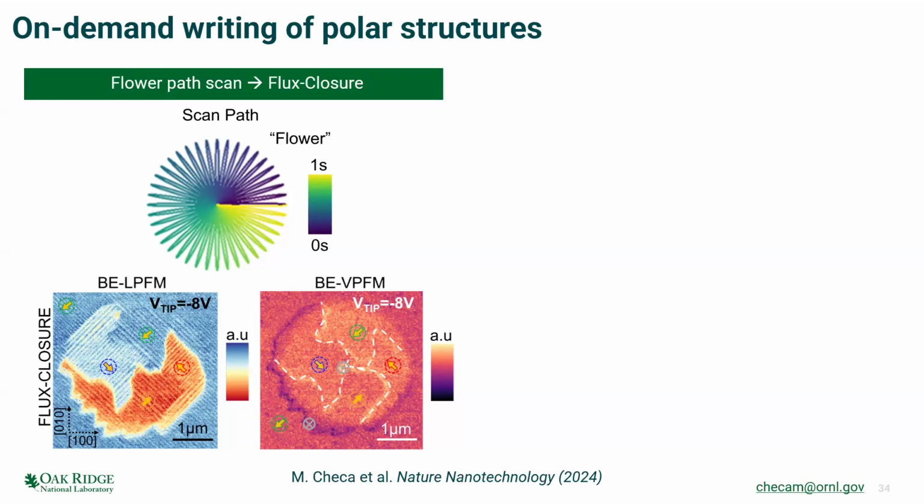One could think that in this case, when you zoom in on those boundaries, you do have all the cases, because then you start seeing the A1, A2 lattice. And in this lattice, you do have some cases where you have frustration and some that don't. It probably is just less seen in this case, or this effect is not as strong as in the other one, because you don't have a direct head-to-head. That makes sense.